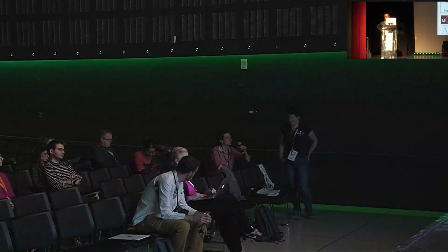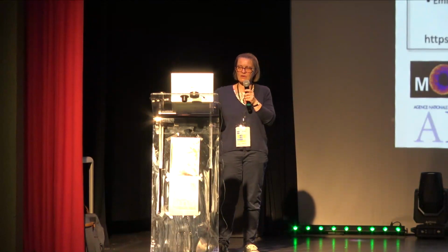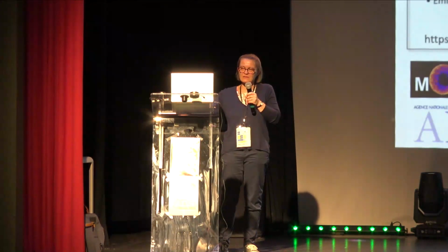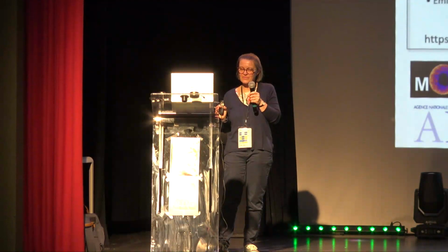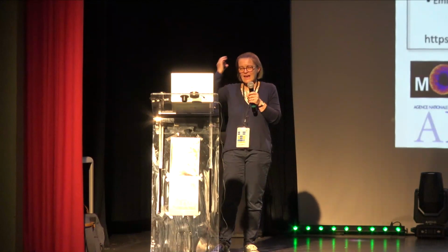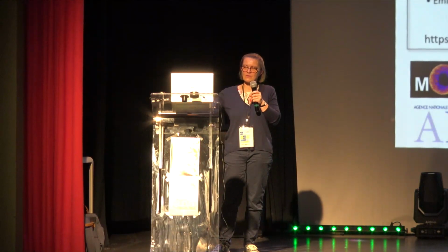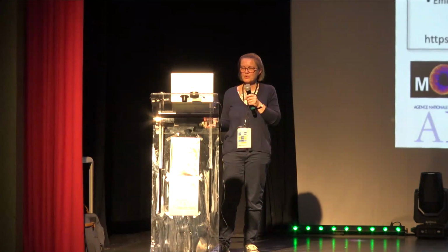Yes, it's possible. Actually, I've not presented these results, but we have done some mechanical assays under the microscope, to really elongate some skin and tendon, and also we are doing it with the cornea, but here it's just other types of assays. We are looking at the deformation, while with the mechanical assay we can measure the force, and then we have a Young modulus. So it's possible to do that.